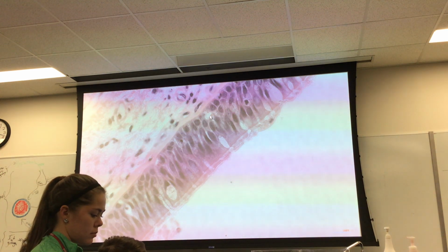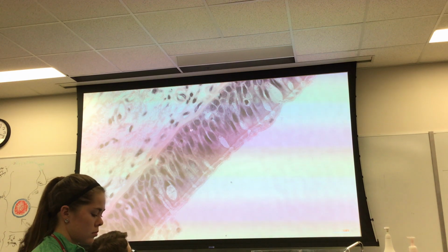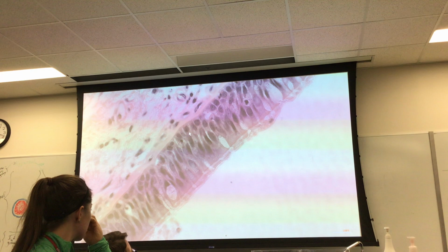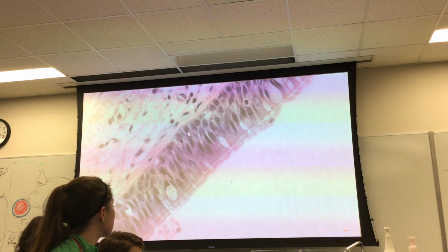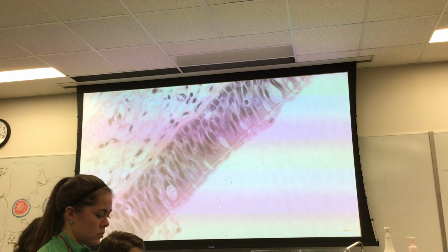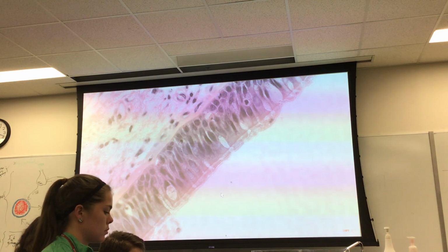And then the fact is that you have these basal cells here. Brush cells may or may not be in the plane of section simply because they're relatively rare. But you'll almost always see basal cells, ciliated cells, and goblet cells. Those are the kind of images that we'll always show you. And that's going to be pseudostratified.